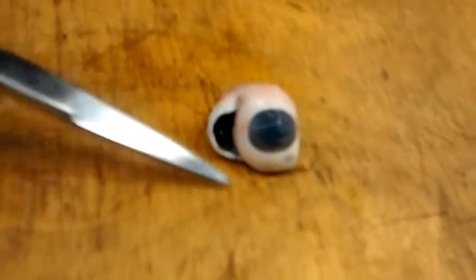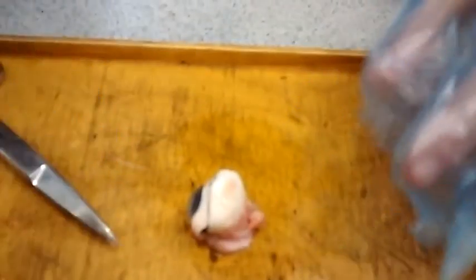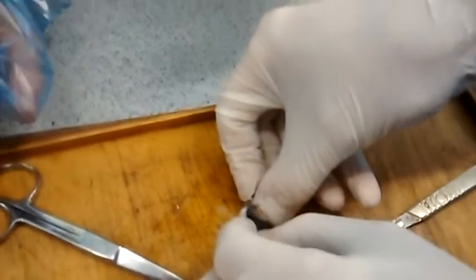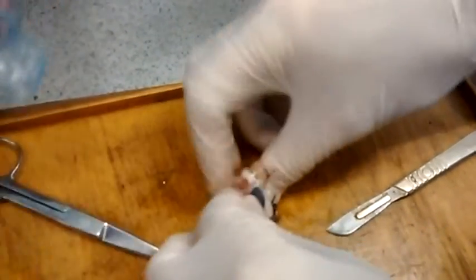By the way, this is actually a genuine eyeball. Come on, hurry up — this video is like four minutes now. Have you got it? Nearly. Oh, cool — there's the lens. There it is. Perfectly clear. Everything is reflected upside down in the lens.